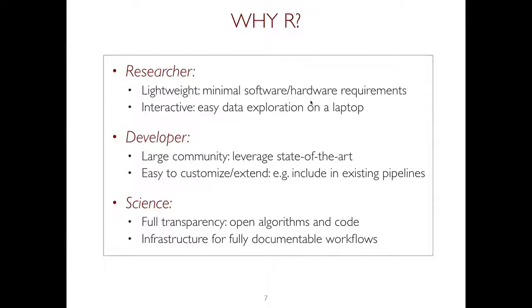So to us, it's quite valuable, but also because it's a scripting language, it can be customized, can be extended to other needs. And also if you, for example, operate a core facility and you have certain pipelines, this type of software can be very easily integrated in the existing software pipelines. So that's another use of this.